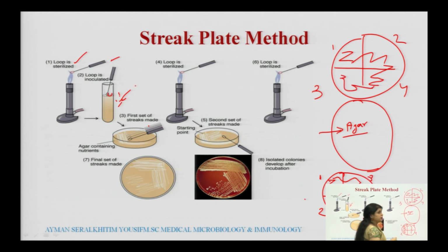So, there are various types of streaking; there may be parallel streaking, there may be multiple streaking. What will streaking do? Streaking will spread the culture which had a number of microorganisms, with the help of the streaking technique, and once you spread it, the microorganisms get isolated.